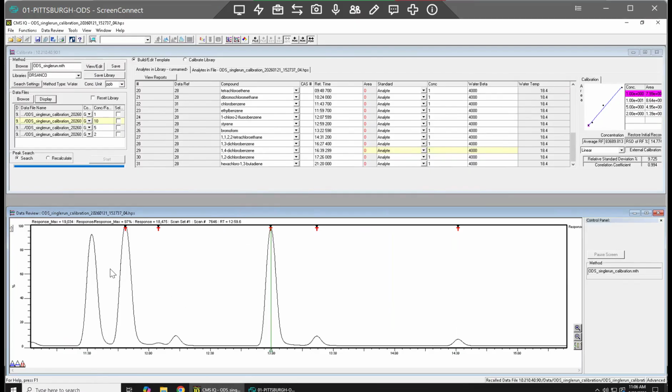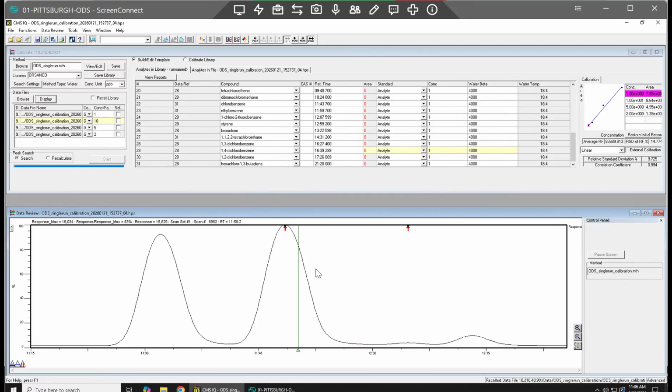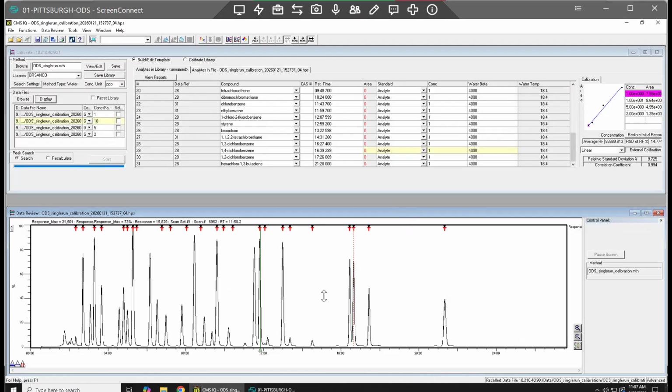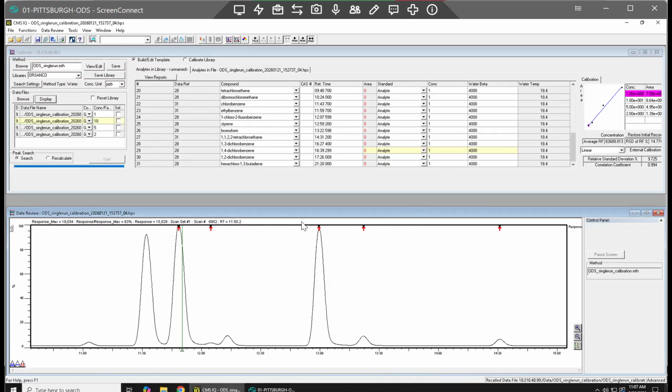Okay. So anyway, here's a few that are not in alignment. So let's start here. You can see there's one cross here and one cross here. And we have this little peak here, but clearly these two larger peaks are way more prominent. And so likely these two crosses are supposed to line up with these. Let me double check if there's another cross close by. I'm going to highlight this whole section here. We have one, two, three, four, five crosses. One, two, three. Yeah, I'm not 100% sure, but I would say these two crosses are supposed to be these larger peaks. So if we look at this one here, let's zoom in more.